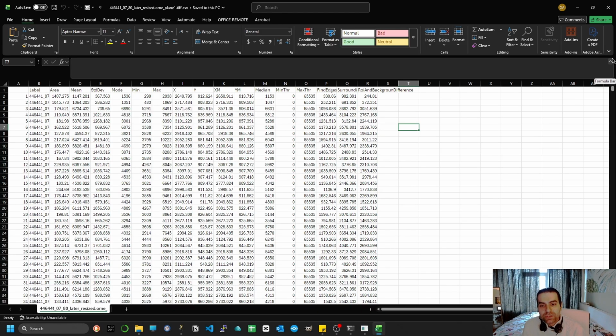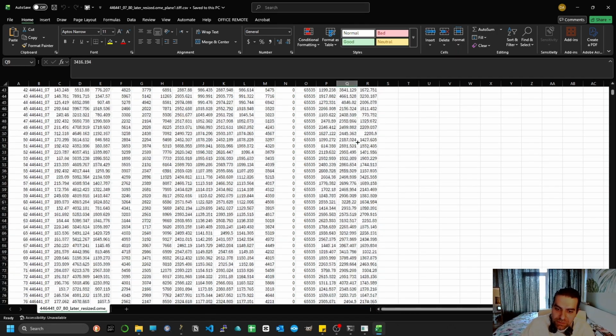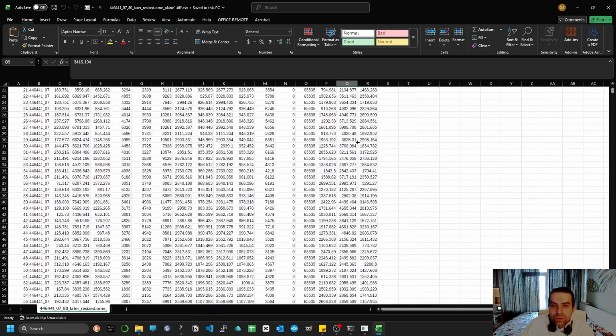This is 5 decimals, and then 1. And this is an artificial value that you might encounter sometimes here. If you do, you should know that these are ROIs that are outside the convex hull or regions that haven't survived the threshold. And in this case, you should remove them, and we'll see how very shortly.